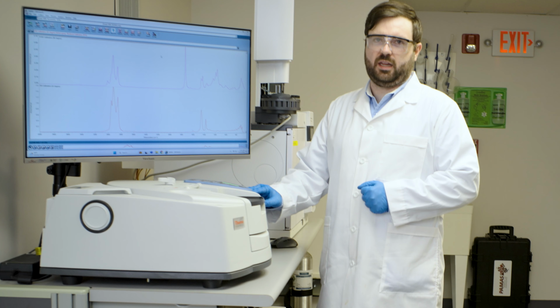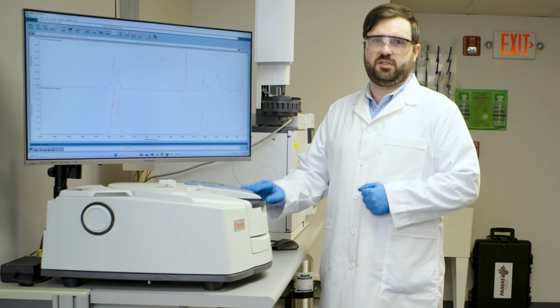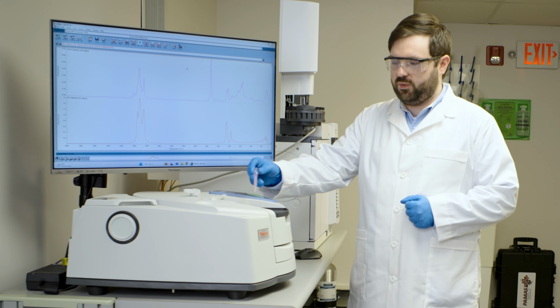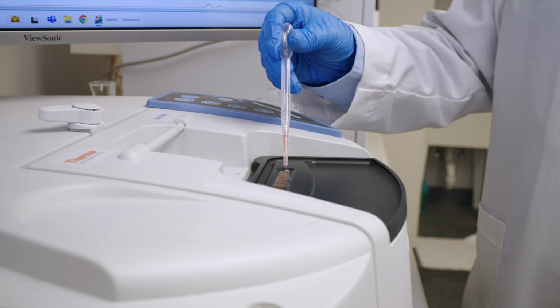Here we have what's called an FTIR, and this is basically a souped up version of our biodiesel analyzer that we looked at earlier. So we're going to do a similar thing with the fuel sample here. We're going to take a small amount of fuel and put it on this cell here. So what we're going to do is shine a light onto this fuel sample, and based on how that light reflects or is absorbed, we can see not only the biodiesel content of a fuel, but we can see all the chemical bonds that are present in there.